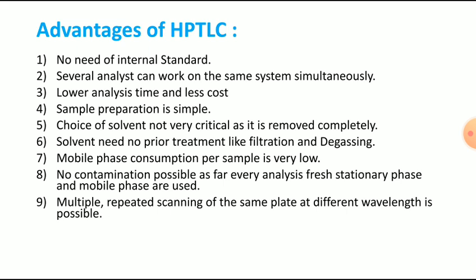Since all fractions remain stored on the plate, you have many options for evaluating or documenting the fractions both before and after derivatization. So these are all the advantages of HPTLC.